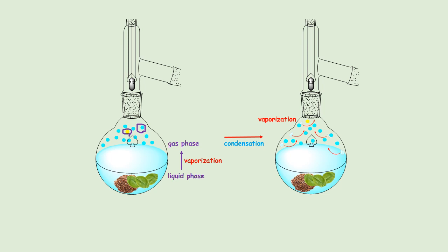But nonetheless, once you hit that 1 atmosphere vapor pressure, then you are actively distilling the mixture. You have the boiling water down here, and the steam is going to actually physically push the oil vapors up. And so when you see the condensation forming on the sides, it's going to look cloudy because it's going to be a mixture of water and oil vapors.